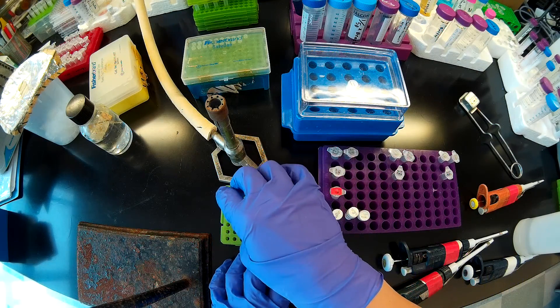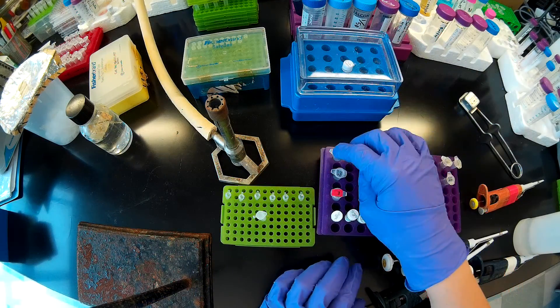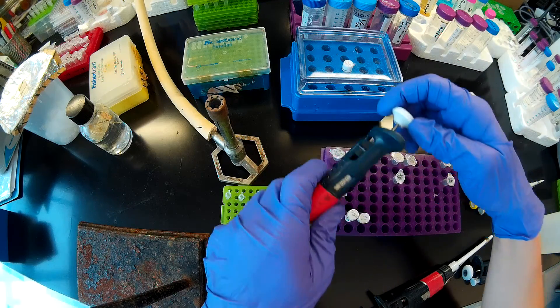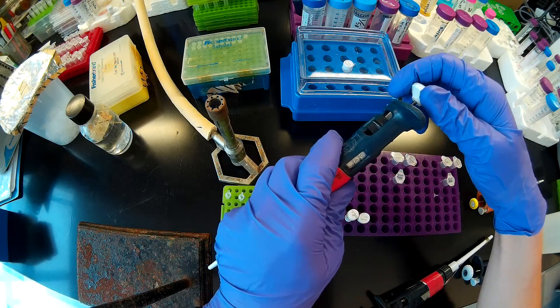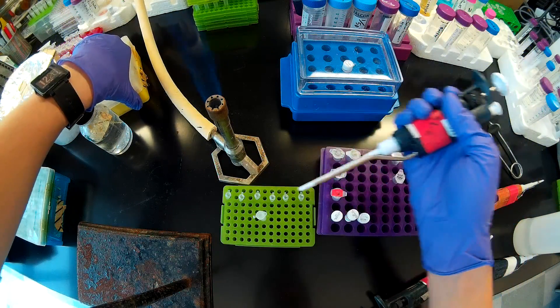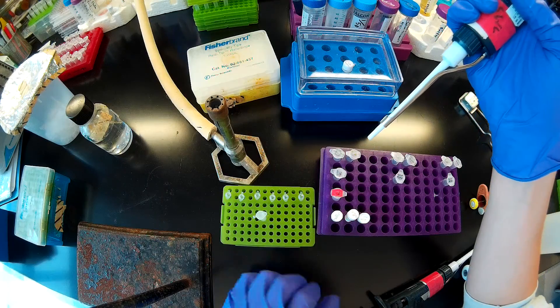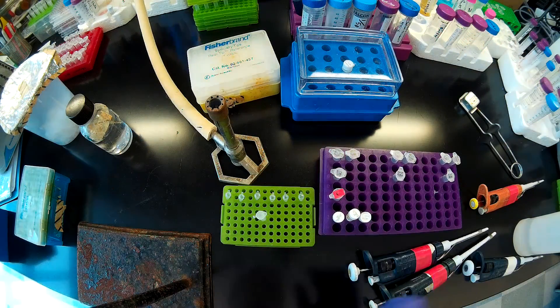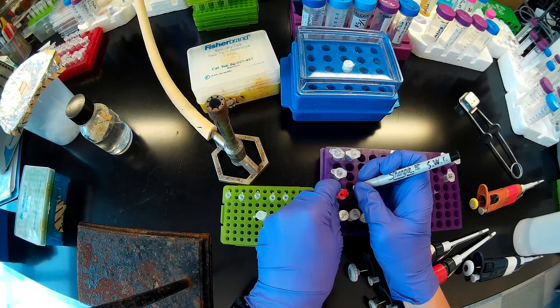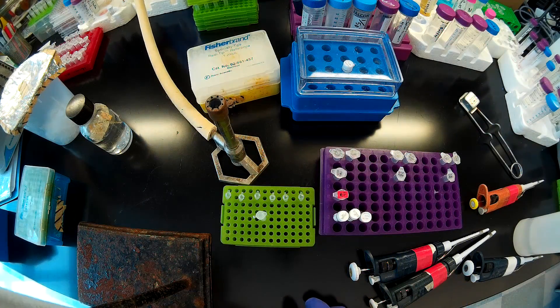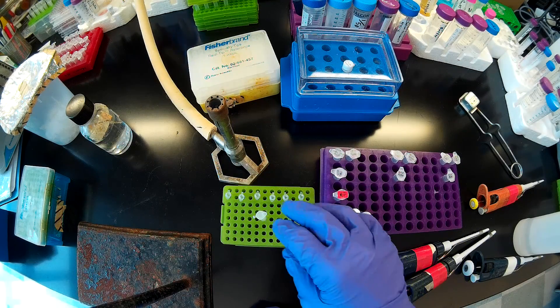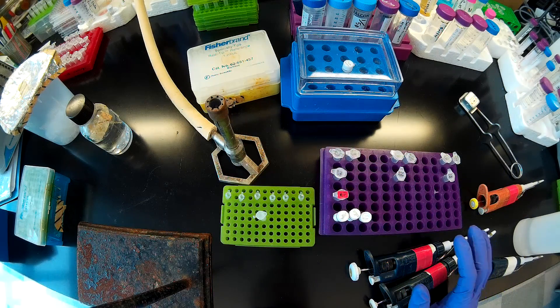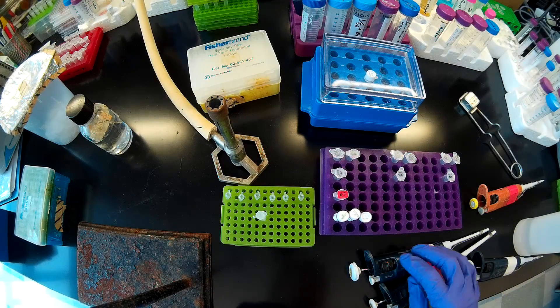Now all I need to add to each tube are the reverse primers and the templates for each reaction. I'm going to go ahead and aliquot out my master mix. I'm going to add 47.5 microliters of my master mix to each tube. The master mix that you prepare is dependent on what PCR reactions you're going to be doing later on.